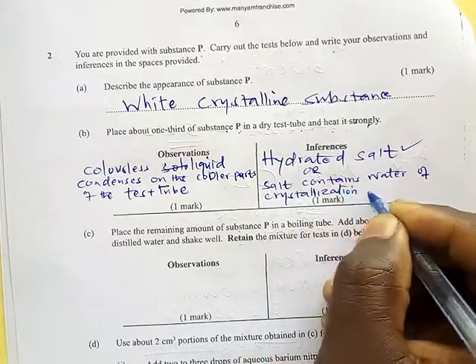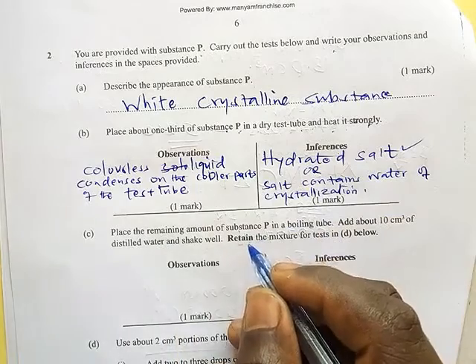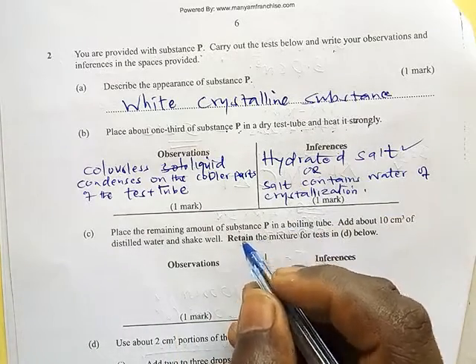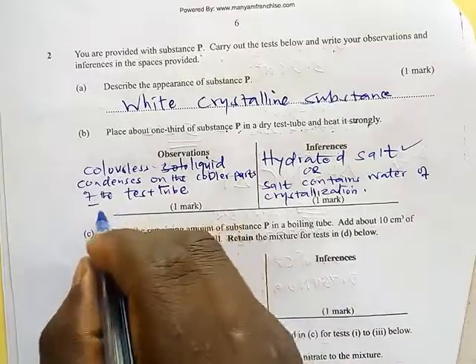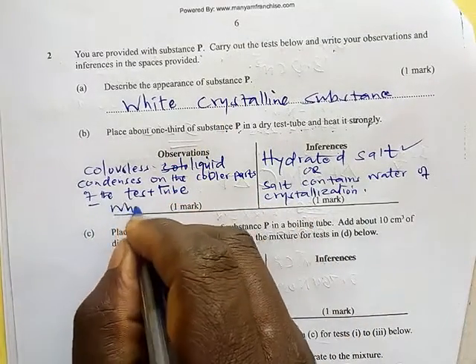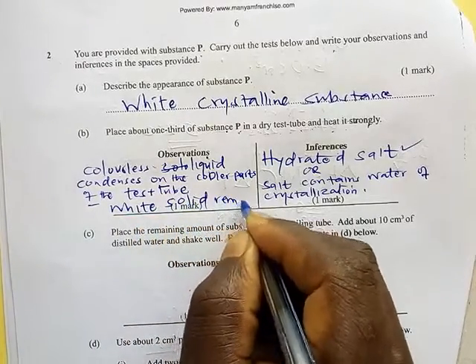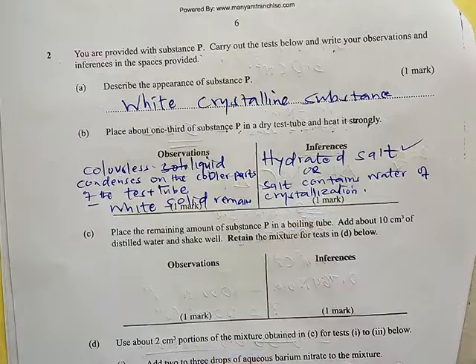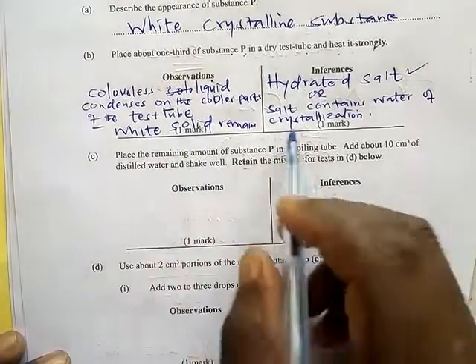So either is acceptable. Another observation which you can make is that the solid will remain. What will be the color? A white solid remains. A white solid is formed or remains. There you don't need to make any inference.